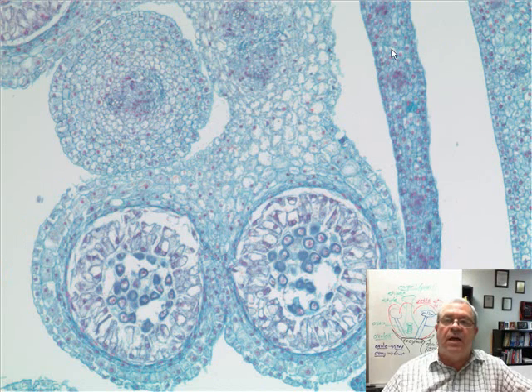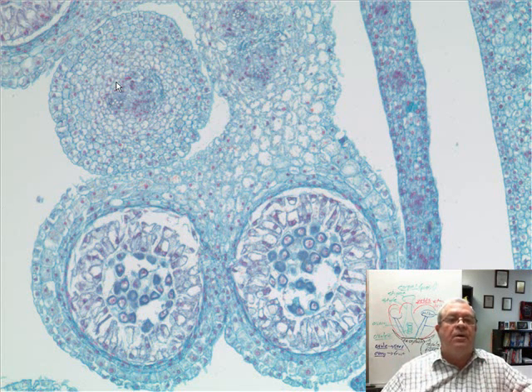And so as we move farther toward the middle, what do we see? We see now to the right some baby petals, and then we see more of this stamen. Here is what part has two sacs here I see. There's a third sac up there. This must be what part of the stamen? The anther. What's this part right here? It is the part that holds it up in the air. Once everything is opened up, it holds the anther up in the air. This must be the what? The filament.